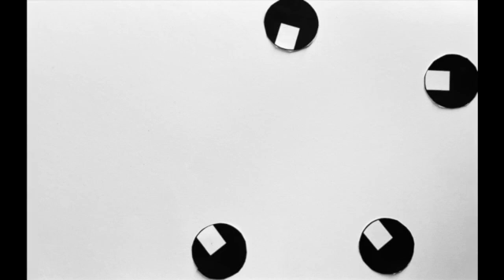After antigen is added, the wells are washed. The wash step is important for rinsing out anything that is not bound to the antigen, and it also prevents non-specific molecules from binding in future steps.